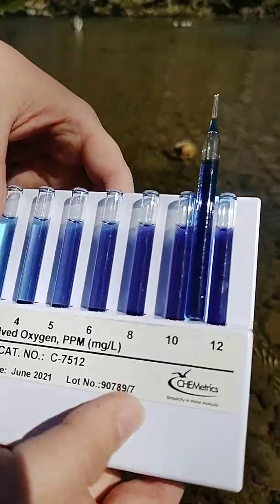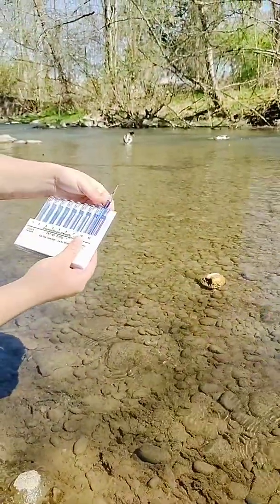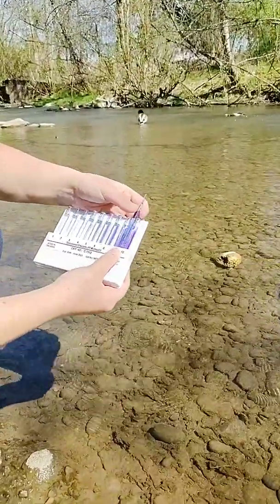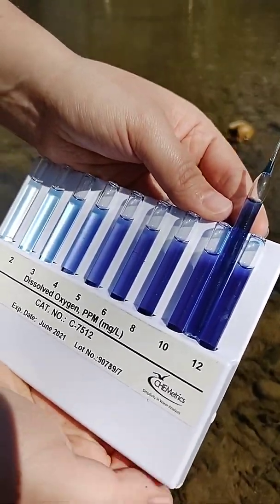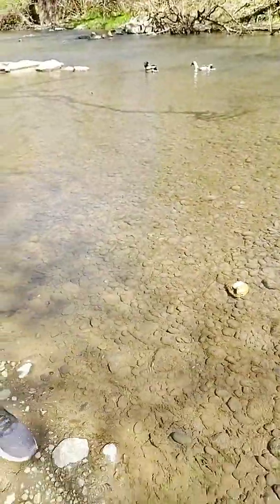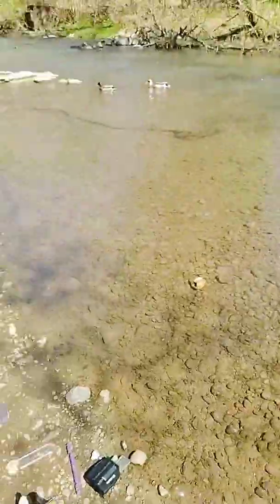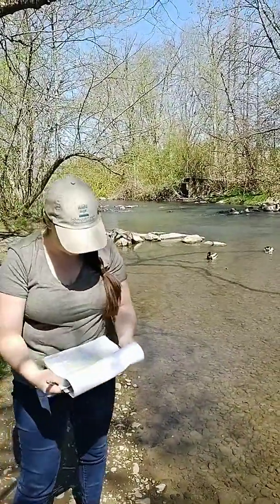Yeah, so now that we've done that, I'll go ahead and take a look there. I would say it's pretty close to the 10 mark, maybe in between, so about 11 is what I would say its approximate color is. Yeah, so real quick, I'm going to set this down, and I'll write that on our data sheet that we got 11. So now we're going to do our last test, which is turbidity.